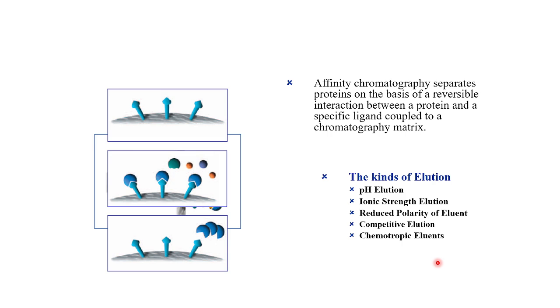Why is it different from ion exchange? When I talk about ion exchange, you can actually get it. Otherwise, I'm telling you, we usually do not use chaotropic eluents, because what I want to focus on here is basically proteins. You would not want to treat your protein of interest with any chemicals or denaturing agents, that will actually open up your protein or hamper the function of a particular protein.